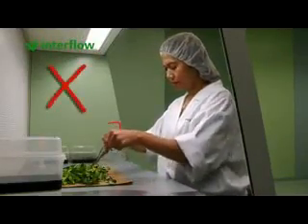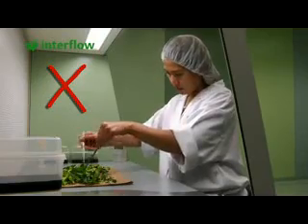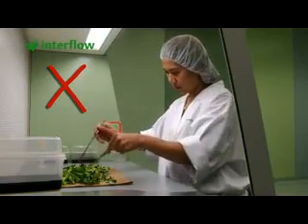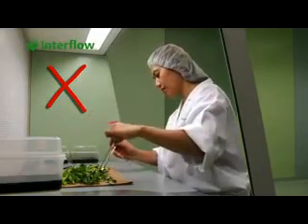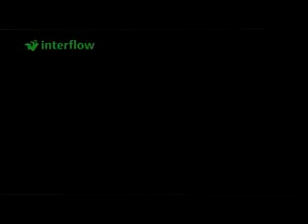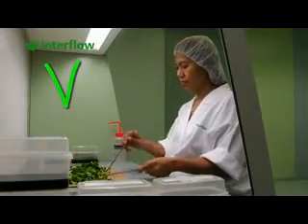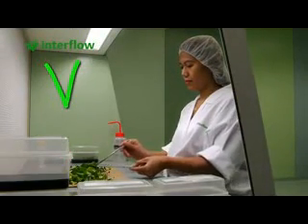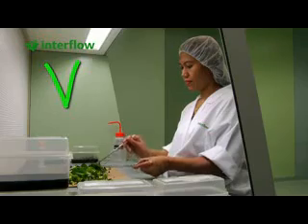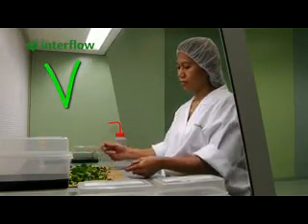It is not good to work with your hands above the product. Your hands contain bacteria, which can fall onto the product and therefore contaminate it. It is better to work as horizontally as possible, next to the product. Make sure the air flow protects the product at all times and disrupt this process as little as possible.